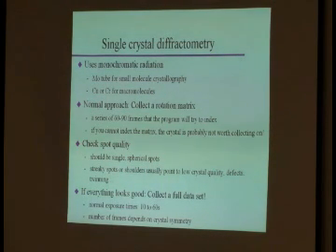That's when you have that trade-off between what can I actually detect with the exposure time, because your background also goes up the longer you expose, of course.